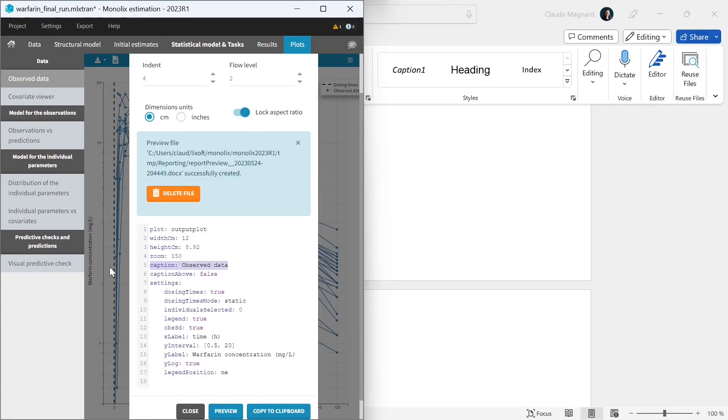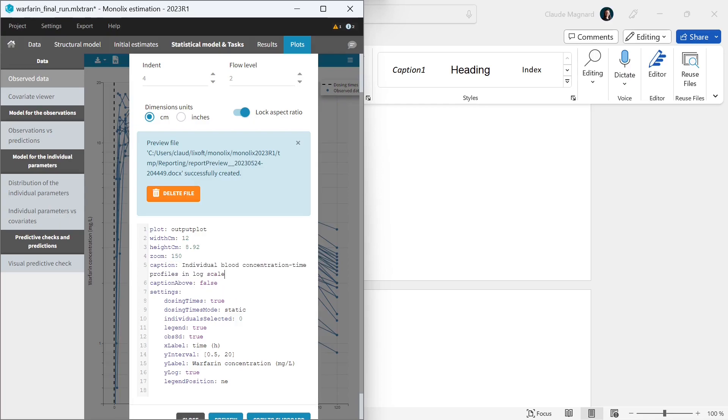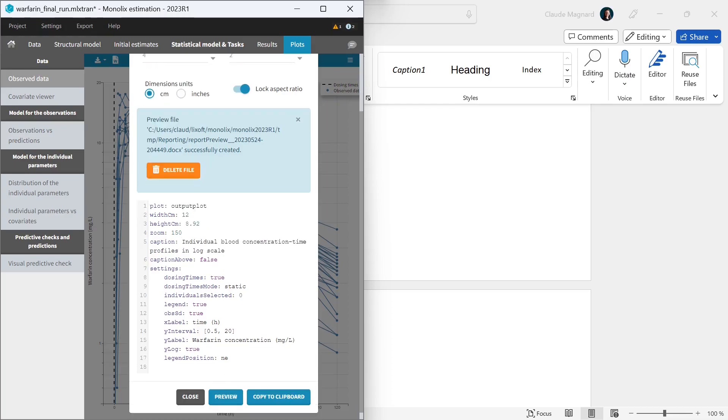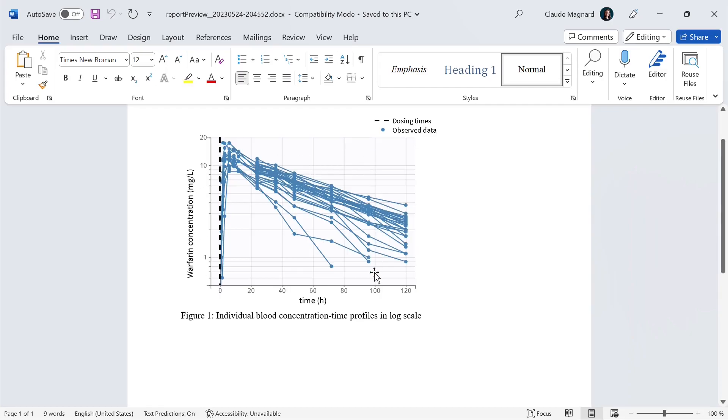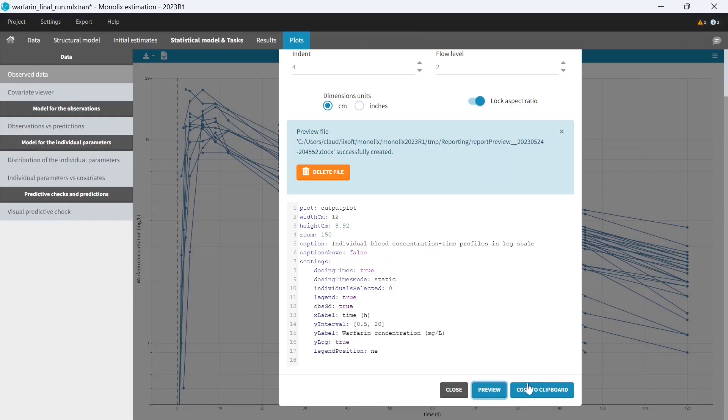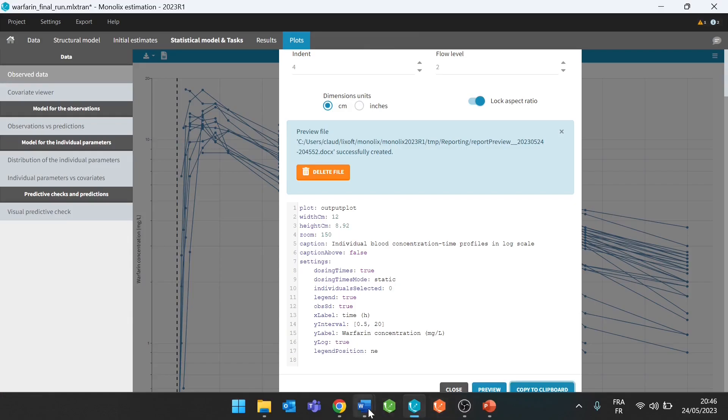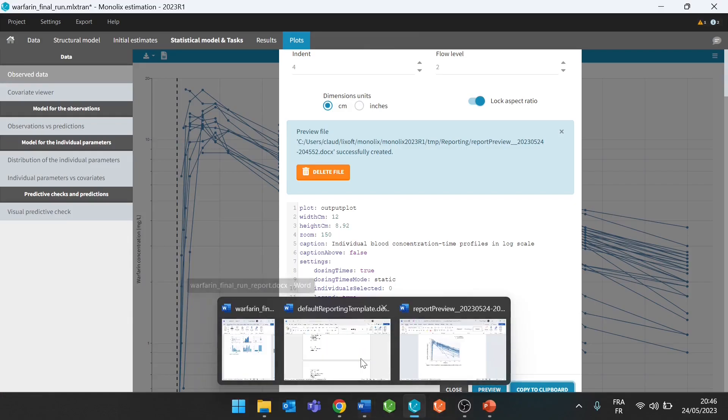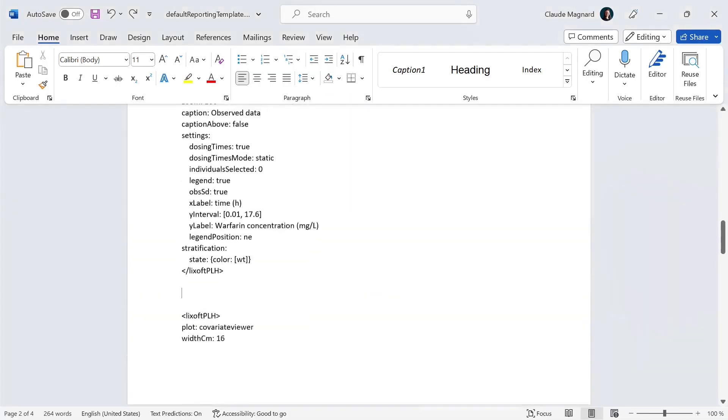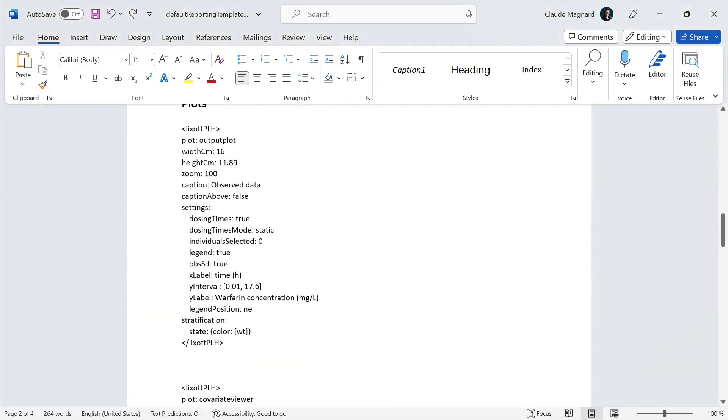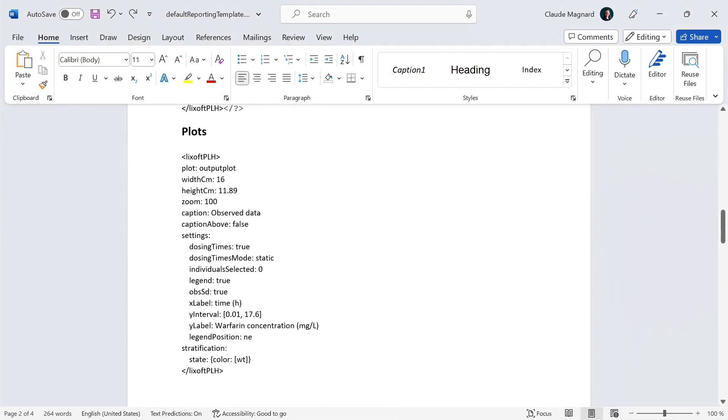The caption enables to have custom text instead of the default name of the plot, which is observed data in this case. Let me call it individual blood concentration time profiles in log scale. After making this change, I can do a last preview. So now that I'm happy with the preview for this plot, I can copy this placeholder to the report template, and I'm going to put it just below the first plot for observed data.